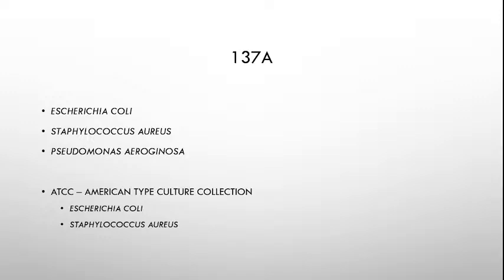Hindi pwede yung kinuha mo lang kay Clarice, tapos kung example merong respiratory infection na na-isolate kami kay Clarice na nagpatubo siya ng Pseudomonas aeruginosa dun sa sputum niya. Hindi pwede yon. Kailangan may pinanggalingan. Okay? That's the reason why you have to have an ATCC certificate for every reagent control organism that you will have. Similar to blood bank, 'di ba? Parang ganun din siya kasi it needs to have certifications.